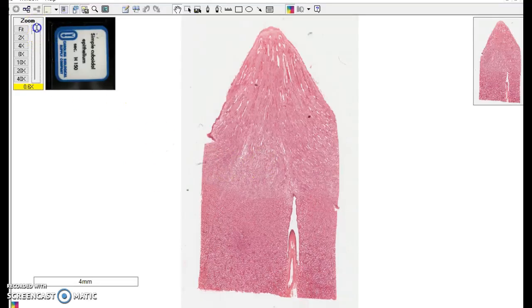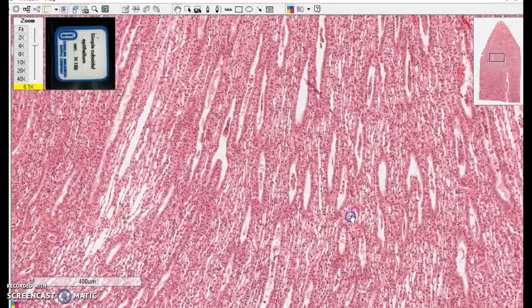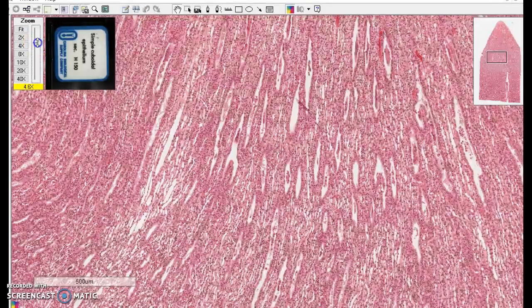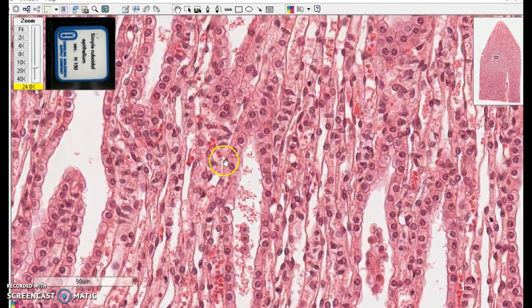We're kind of far out so let's zoom in a little bit so we can see things better. Up in this area we see long chains. Always reminds me of a bicycle chain.